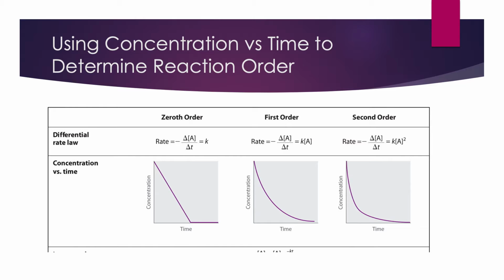It's kind of our first time doing that portion of the experiment here for 12-12, so we're trying to figure out maybe what caused that for some groups. I know some of the last groups on Tuesday in particular, I think we might have had some issues with their sodium hydroxide that might have caused things to look like this, when hopefully our plots from last week look closer to what we see over here for 1st order.